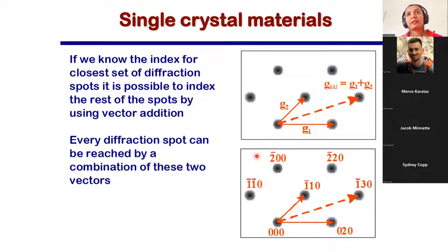Now, first of all, when you have a diffraction pattern, you have to find the building block of the diffraction pattern. Here, the building block of this diffraction pattern has two distances in it. If this is a center spot, in some diffraction patterns you would see that the distances G2 and G1 are the same, depending on the crystal, and then it would be a proper beautiful triangle. And here it is a triangle where the sides are not equal.